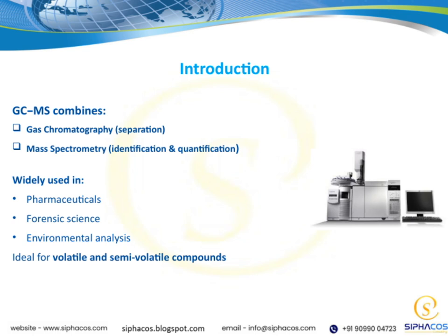One key advantage of GC-MS is its suitability for volatile and semi-volatile compounds. These are substances that easily vaporize, making them ideal candidates for analysis with this technique. Overall, GC-MS provides detailed, reliable information that helps us understand complex mixtures in many scientific and industrial applications.